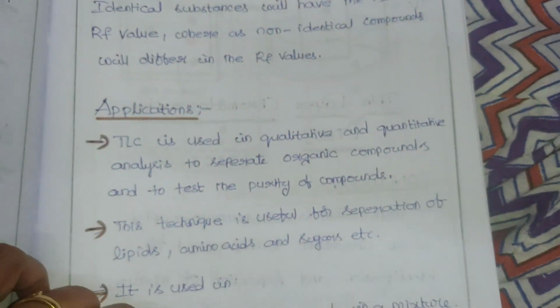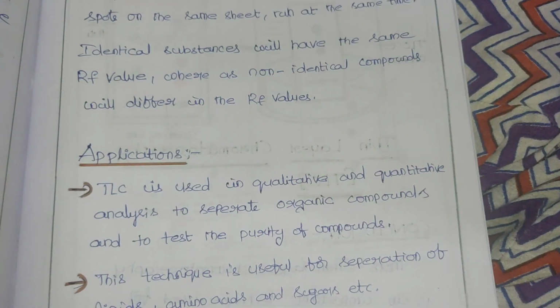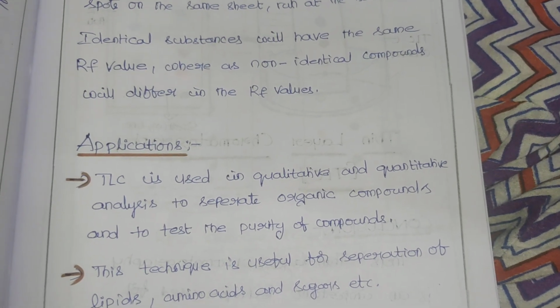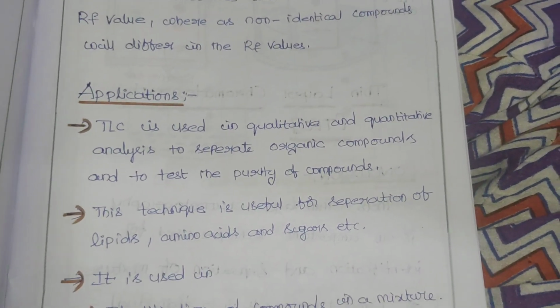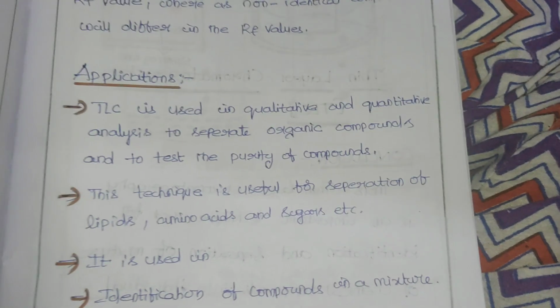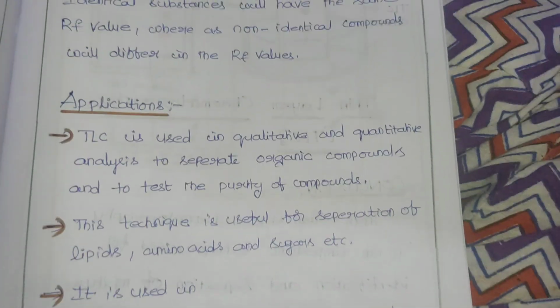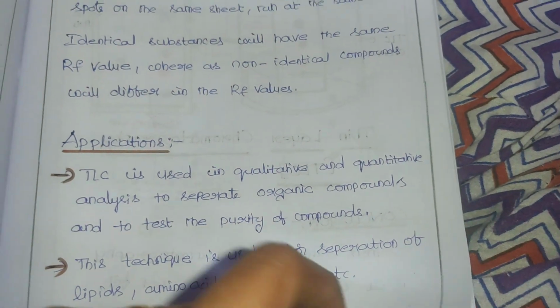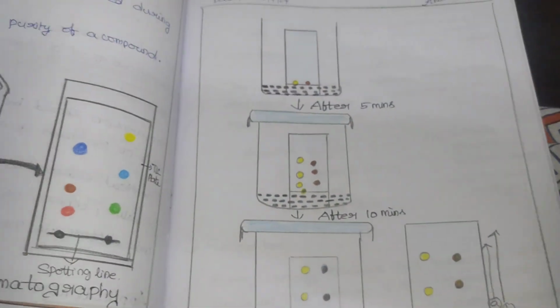Now the applications. It is used in qualitative and quantitative analysis of many organic compounds, and also to test the purity of compounds. It is also used for the separation of many lipids, amino acids, sugars, etc., and the identification of compounds in a mixture. So these are the applications of thin layer chromatography.